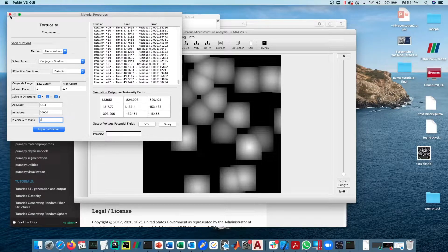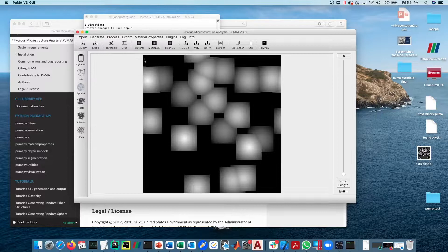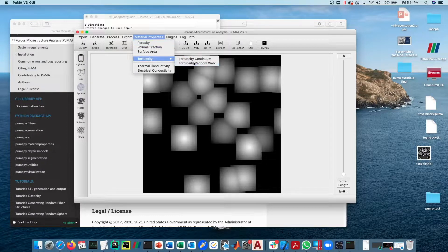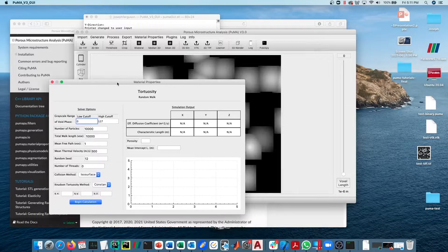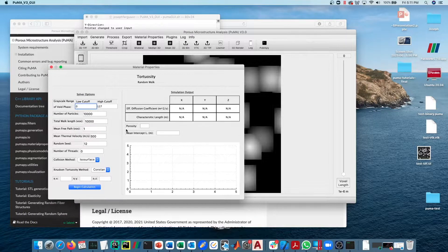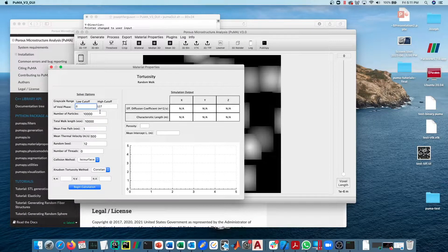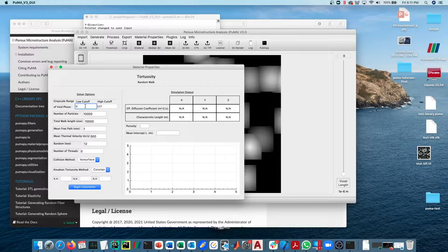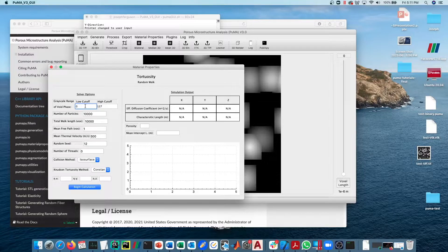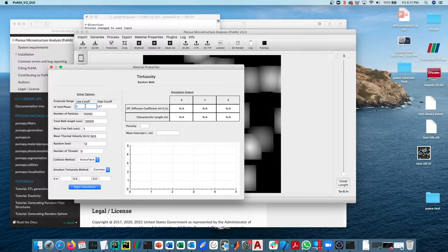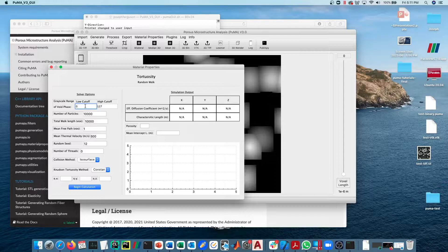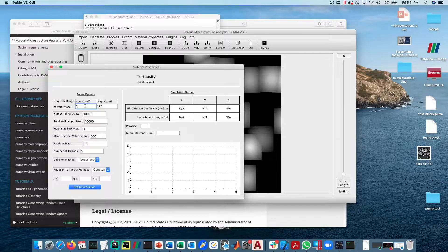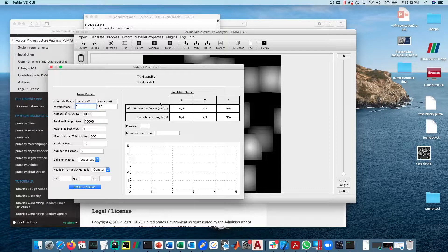Moving on to Material Properties, Tortuosity, Random Walk Tortuosity. The random walk tortuosity is going to use particles instead of using a continuum-based solver like finite difference or finite volume. We're going to populate the domain with a bunch of particles and then we're going to diffuse those particles for a certain amount of time and then see how far the particles diffused. Based on how far the particles diffused, we can then back out what the tortuosity is.